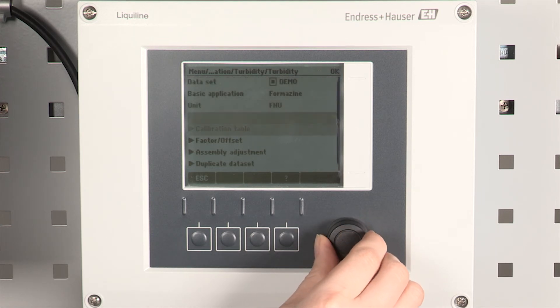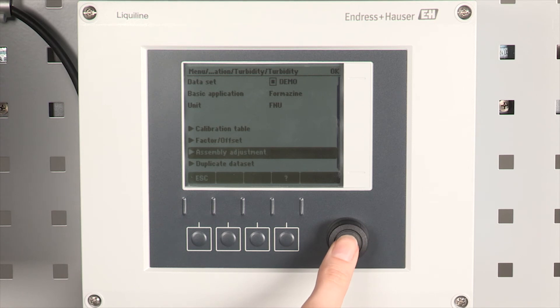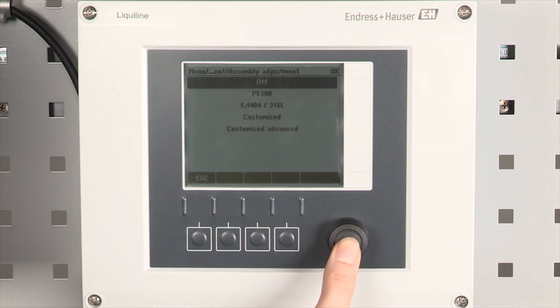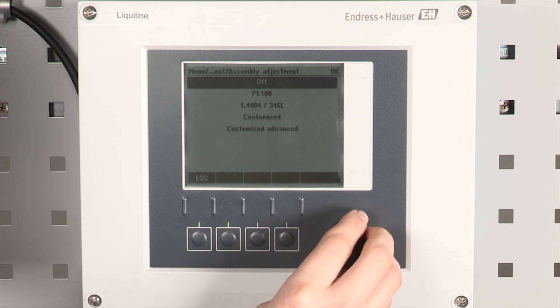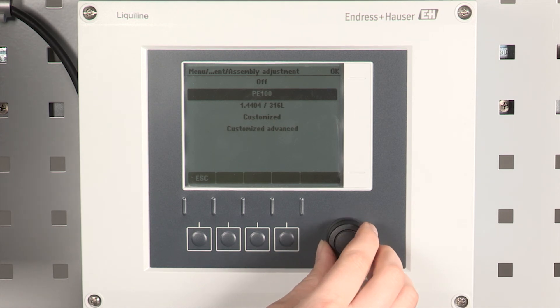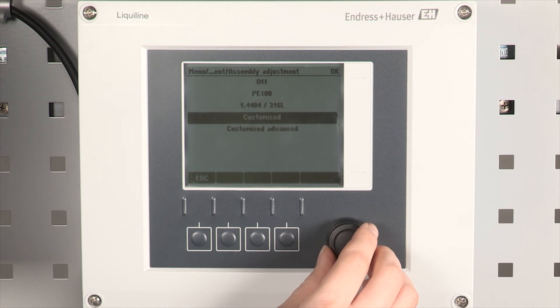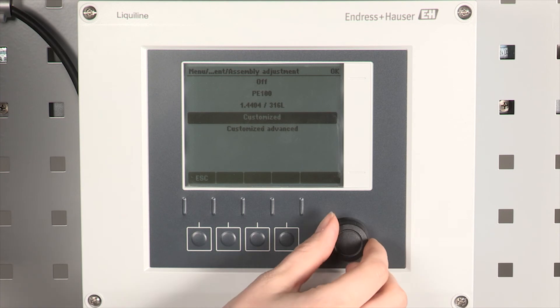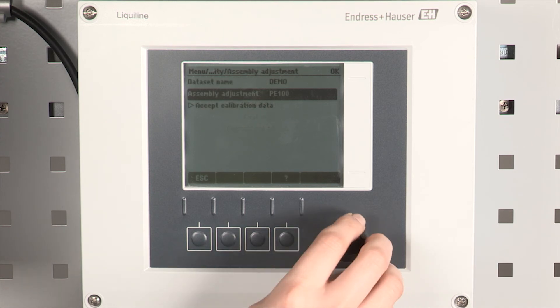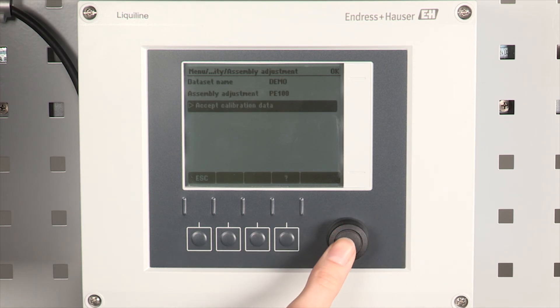New options are now displayed including the assembly adjustment option. Select assembly adjustment and switch from off to one of the following options: Select PE100 when the sensor is installed in a CUA252 assembly. Select 1.4404-316L when the sensor is installed in a CUA262 assembly. Select customized when the sensor is installed in a pipe. In our example we use a CUA252, so we select PE100 and press accept calibration data.